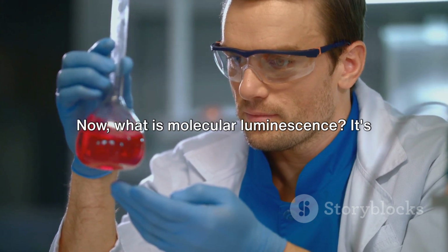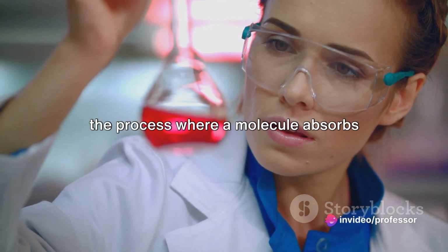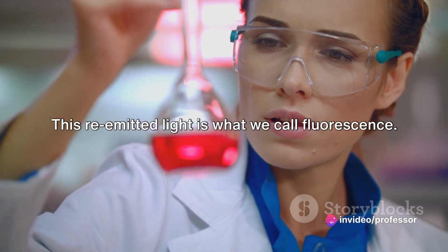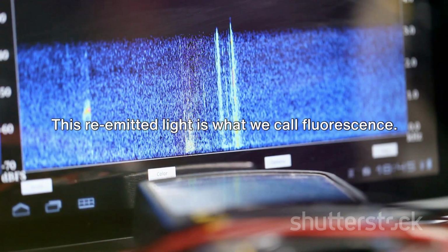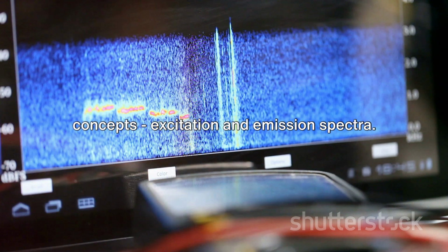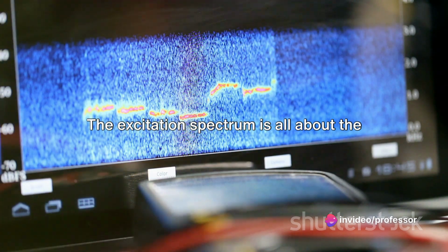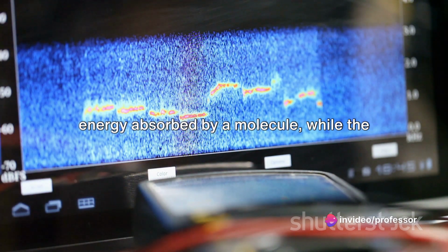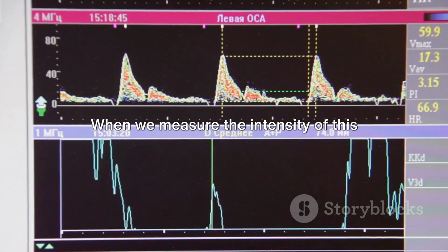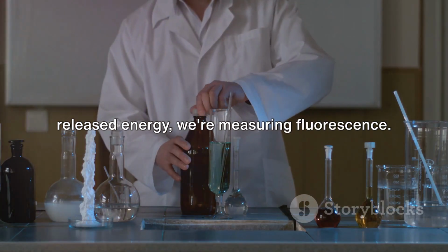Now, what is molecular luminescence? It's the process where a molecule absorbs light, or photons, and then re-emits them. This re-emitted light is what we call fluorescence. At the heart of fluorimetry lie two key concepts: excitation and emission spectra. The excitation spectrum is all about the energy absorbed by a molecule, while the emission spectrum is about the energy it releases. When we measure the intensity of this released energy, we're measuring fluorescence.